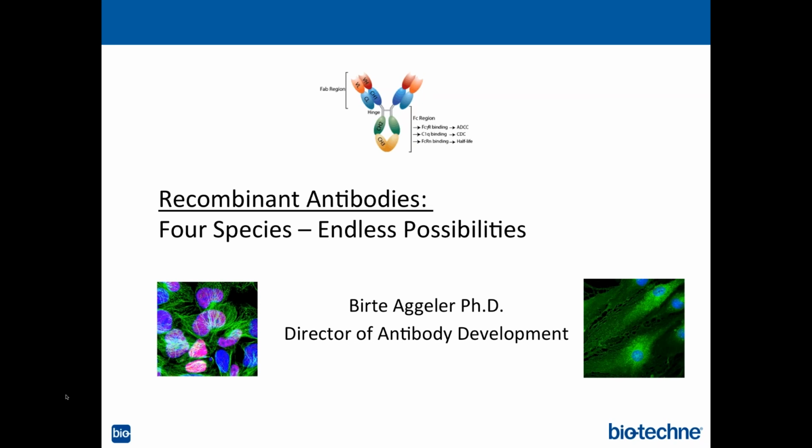So I'm going to talk today about our recombinant antibody technology that we've been developing over the last 2 to 3 years, and it will include data on actually 4 species. I'm not going to go into excruciating detail on every single piece. I'd rather have a broad overview over our capabilities, over the technologies we've developed, to actually spur some thinking on what you can do once you have isolated the sequences from various types of antibodies and the possibilities that come with that once you have a recombinant protein.